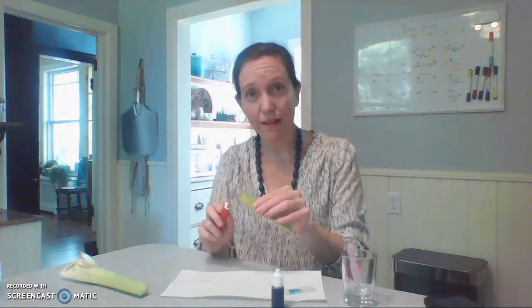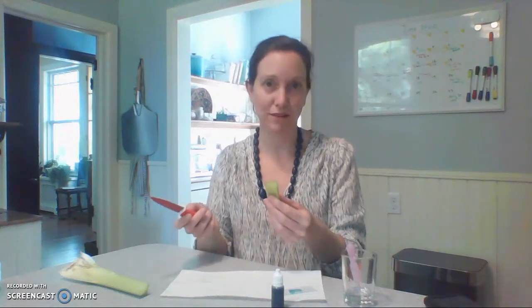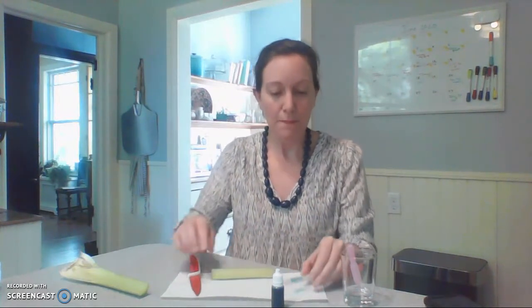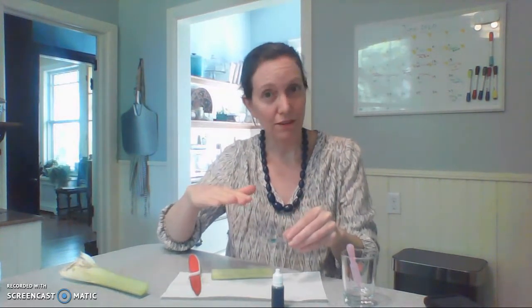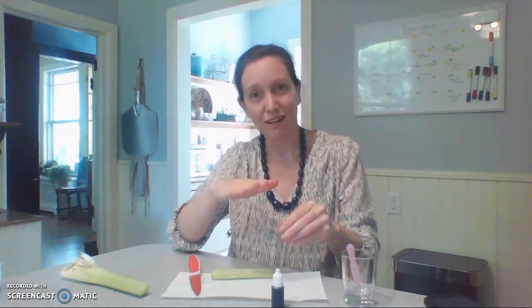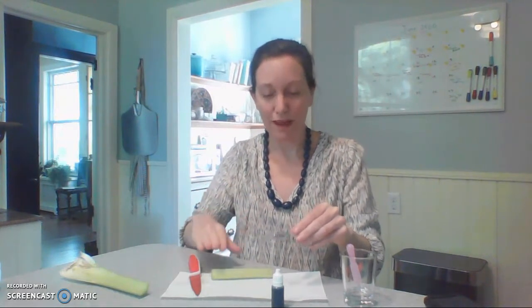Making that very thin slice might take a couple of tries — please don't get discouraged, it takes practice. I've had years of practice, so I can get a very thin slice right away, but you might want to try a couple of slices. If your cover slip is a little wobbly on your specimen, consider doing another slice, because that means one side is bigger than the other and the cover slip is seesawing back and forth.